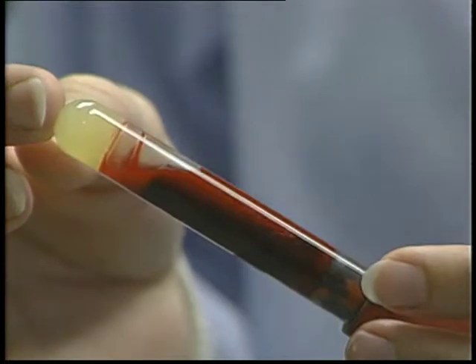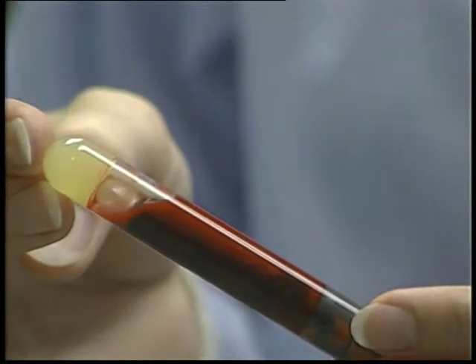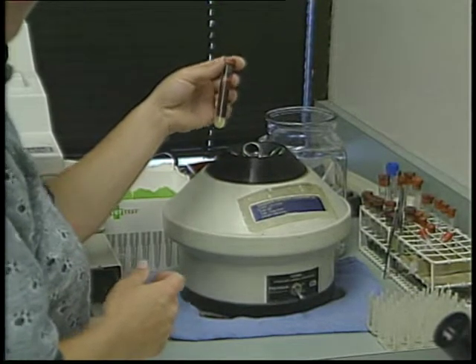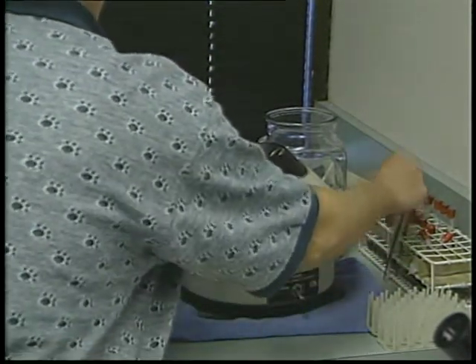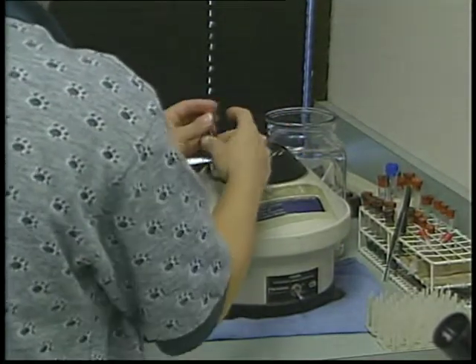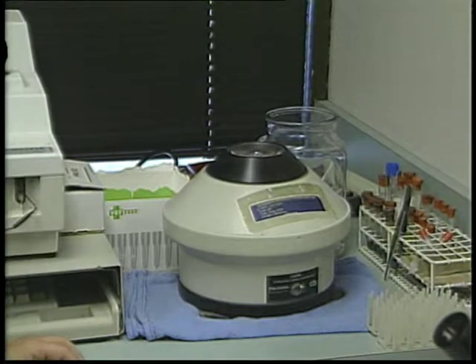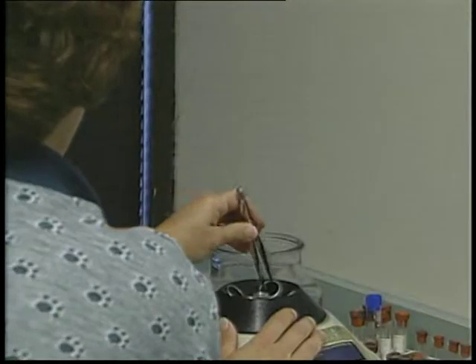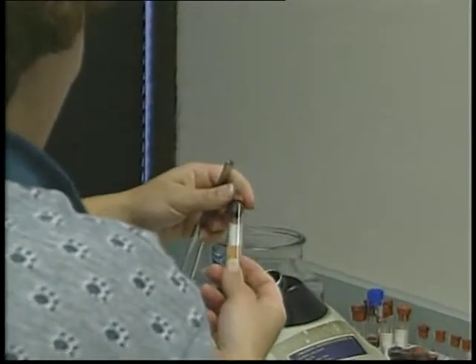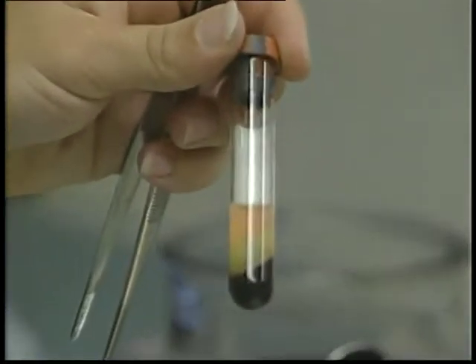Blood contains solid components, mainly red and white blood cells, and a liquid component called serum. Clotted blood cells in a red top tube can be separated from the serum by placing the tube into a machine called a centrifuge and allowing it to spin for 5 to 10 minutes. Always be sure to balance the sample with a similar quantity of water or blood on the opposite side of the centrifuge. This is necessary to keep the instrument spinning smoothly and in balance while spinning. This spinning forces the heavier blood cells to the bottom of the tube and leaves the serum at the top. This process is necessary because it is the serum that contains many of the chemicals produced by the organs.